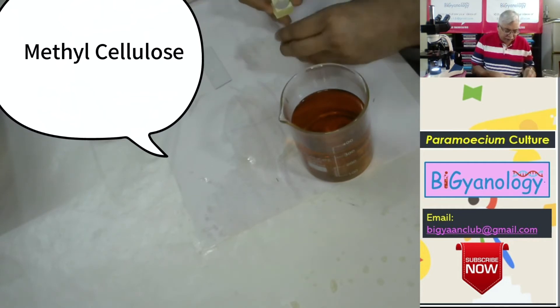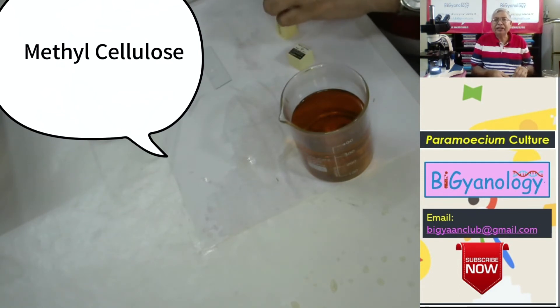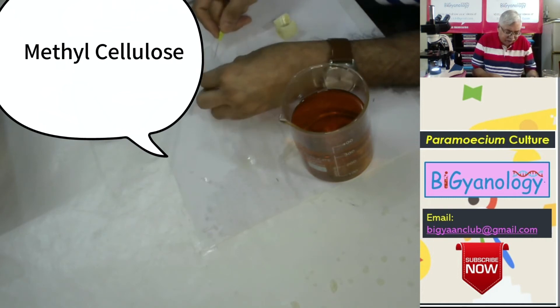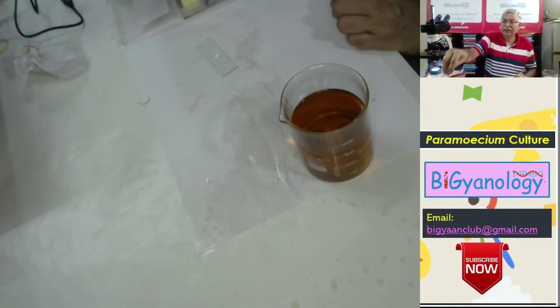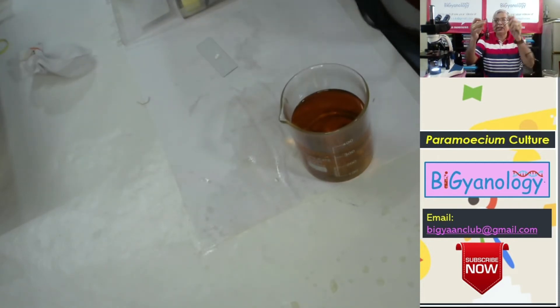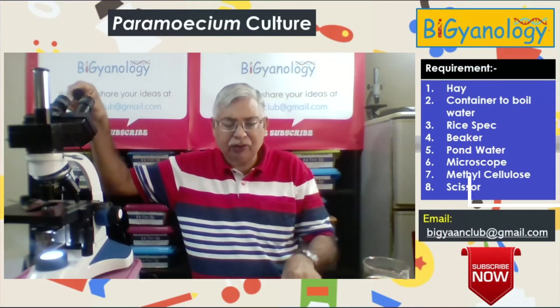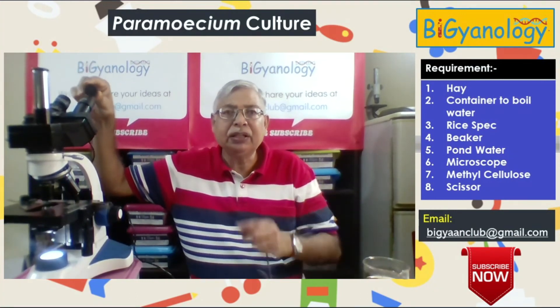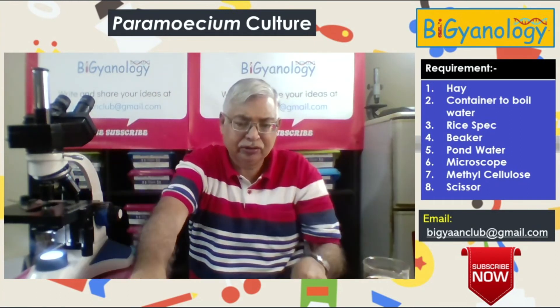Now we put a cover slip so that it arrests the paramecium and they cannot move very fast. I need this microscope, I need this digital lens which will be fitted on the eyepiece. This will go to the laptop, so whatever we are seeing here will be projected to the laptop and I can show it.